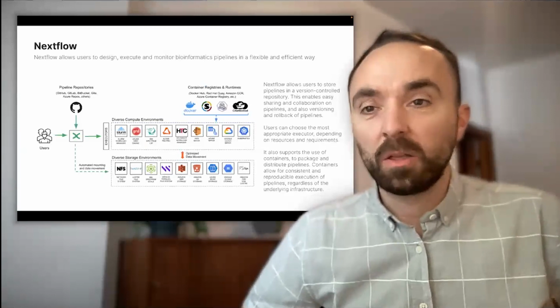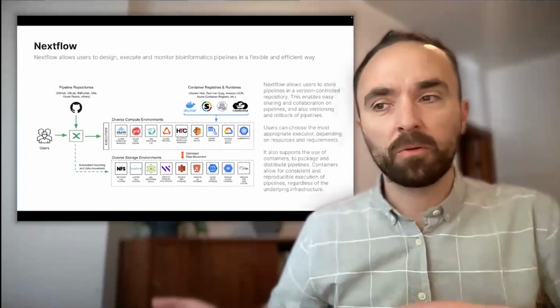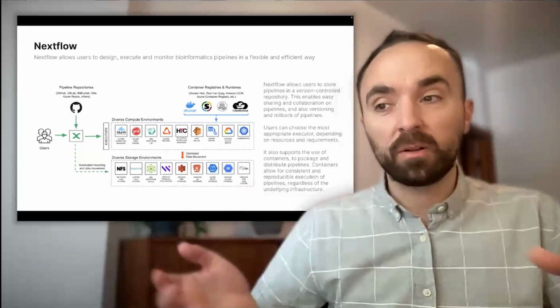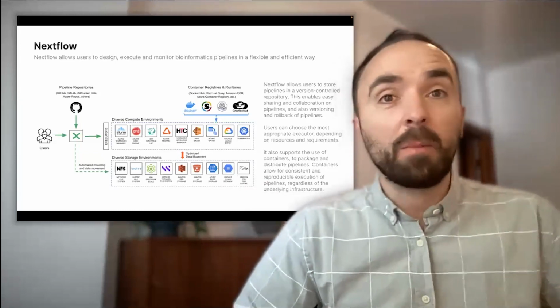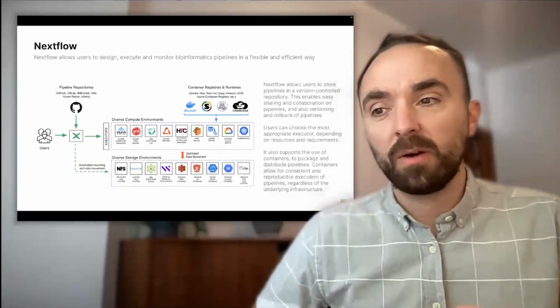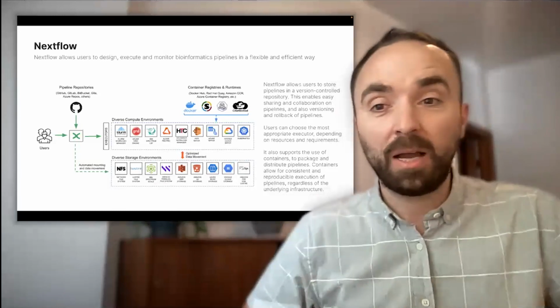The first obstacle a lot of people mention is portability, and this is really fundamental. The abstraction of workflow authoring away from the computer environment allows for the growth of community, particularly among researchers and scientists who can start to work together on a set of shared pipelines, even though they might be using vastly different computational resources, be it HPC or the cloud. This flexibility also provides any organization the flexibility to move their analysis to the data wherever it may lie.